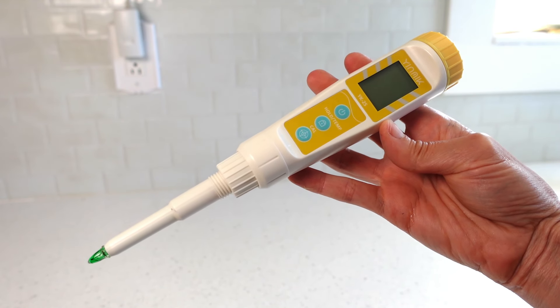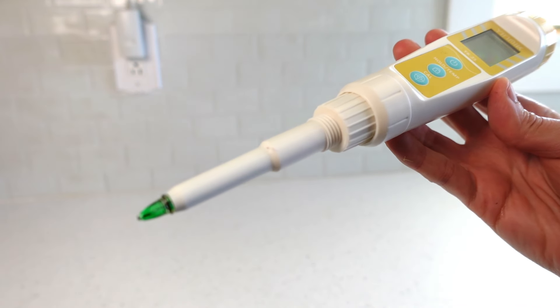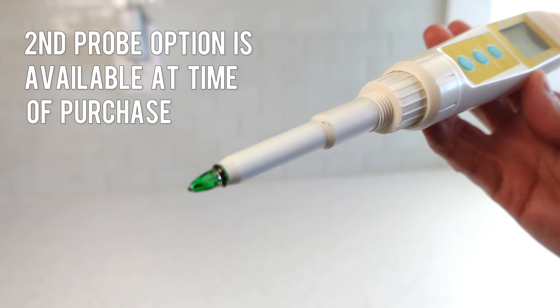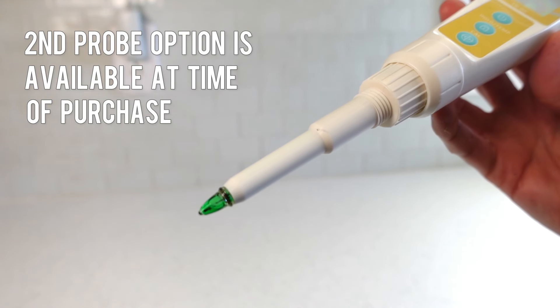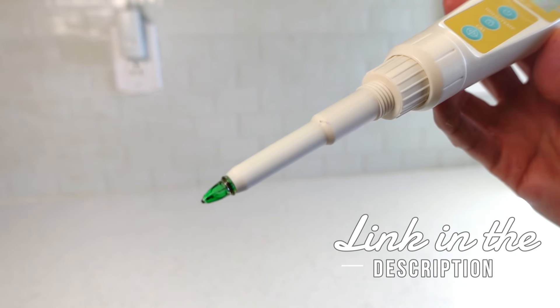Not only is this pH meter more durable and has a broad range of what it can test, it also comes with the option of purchasing a secondary probe. So if this probe gets dropped and breaks, you don't have to buy the whole meter again — you have a backup probe. Hope this video helped, and if you're interested in more beginner-friendly fermentation video recipes, I have a whole playlist for you to check out. Thank you and bye for now!